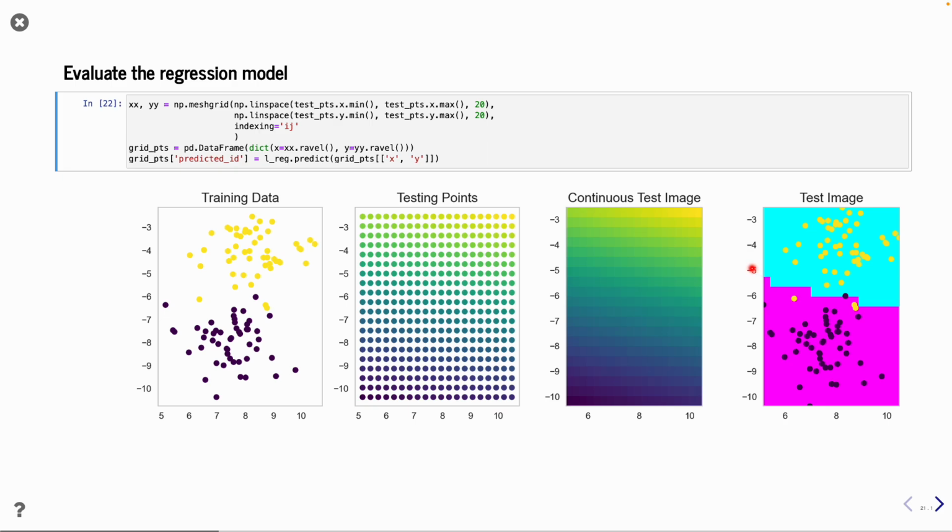Now we can say that we put a threshold on this regression plane. And when we put that threshold, you can see that you have a nice segmentation within this fitted plane. In particular, if you put in the dots, you see that it actually makes pretty much sense.